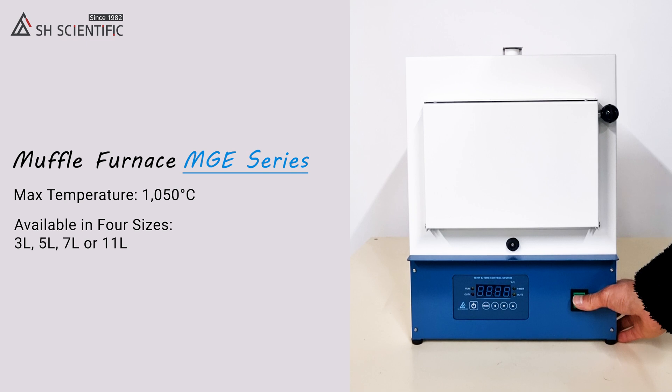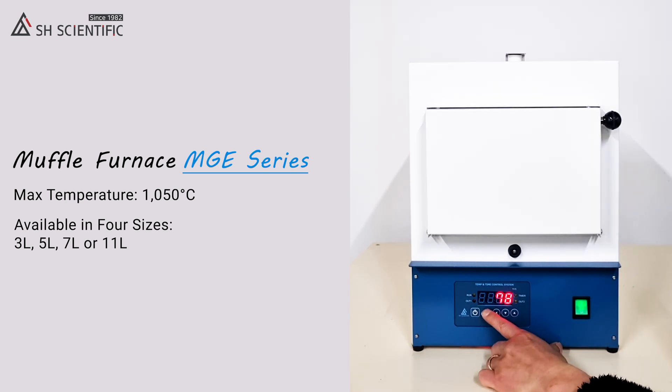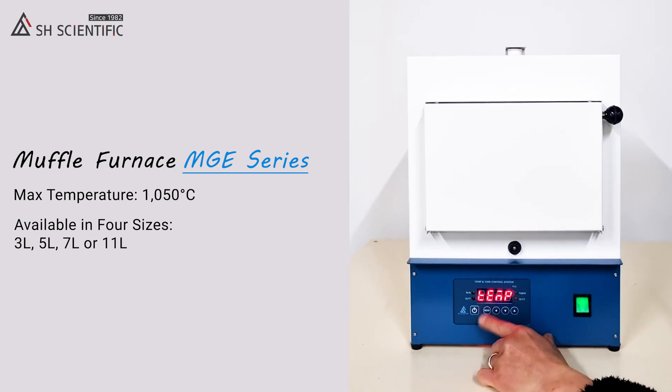Next, turn on the main power switch. Now we're ready to set the time and temperature. To enter the temperature settings, press the Mode button twice.